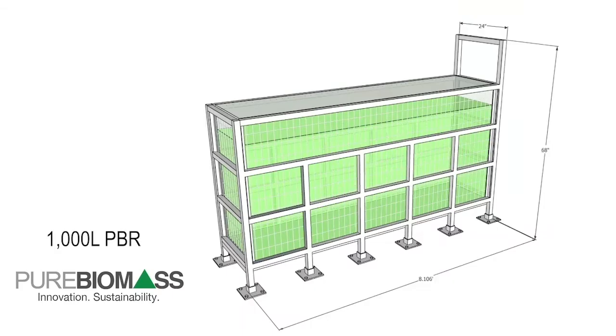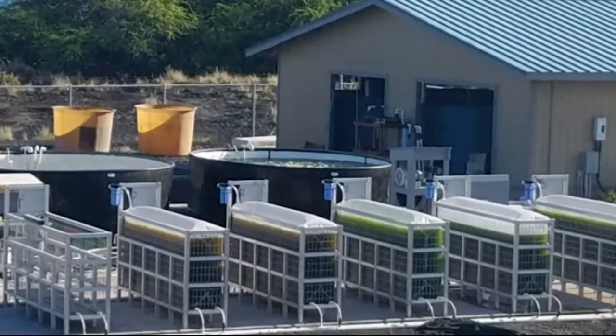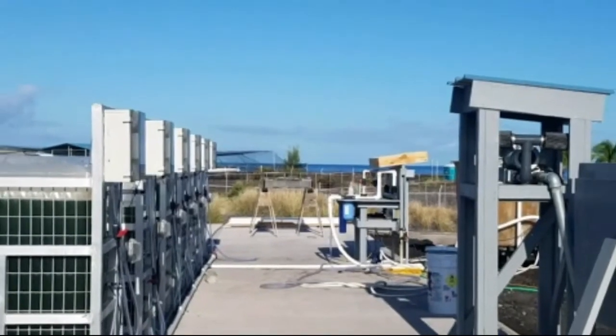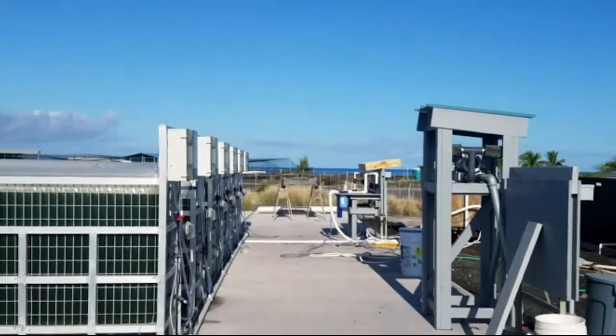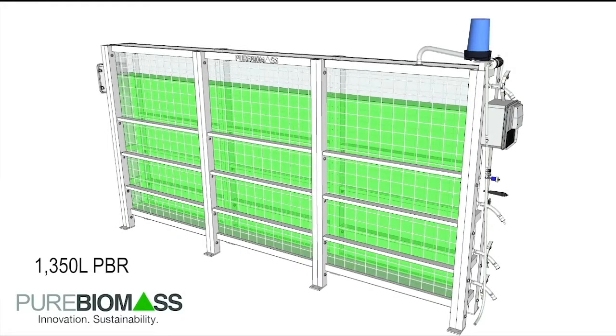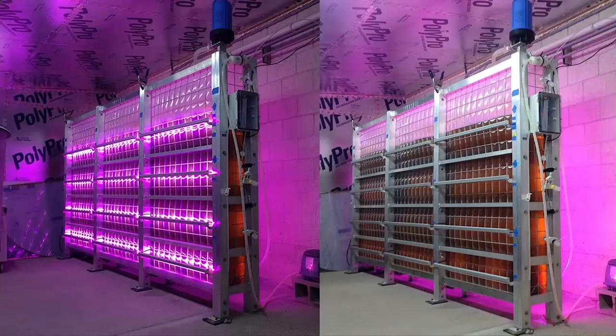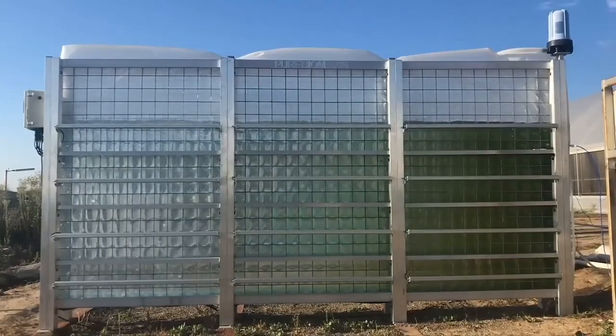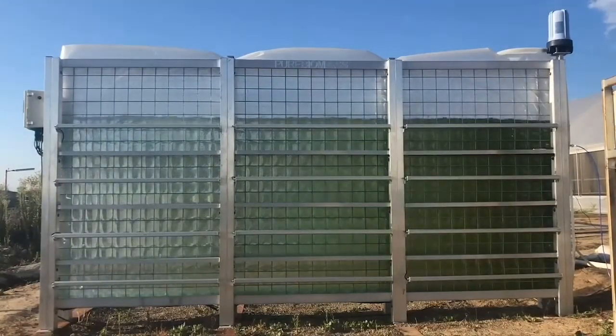These are our 1,000-liter systems, which were one of the first products developed by Pure Biomass in 2012 when the company was first founded, and are now largely being operated as outdoor systems by Taylor Shellfish in Kona, Hawaii. They are very productive in the Hawaiian sun and very easy to set up and operate. Our 1,350-liter systems were developed in 2015 and have continued to improve since their inception. These modular panel systems also come with remote Wi-Fi pH control and options for cooling, and are available with or without LED lighting.